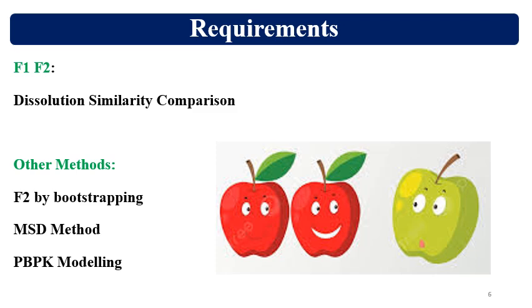Then different methods are there for proving the dissolution similarity. Those are classified as model dependent and model independent. So generally F1, F2 criteria is considered, and if the formulation shows variability or RSD more than 20%, and it is not fitting the RSD or coefficient of variation requirement, then F2 by bootstrapping is done.